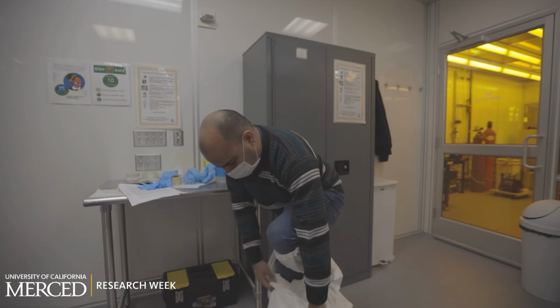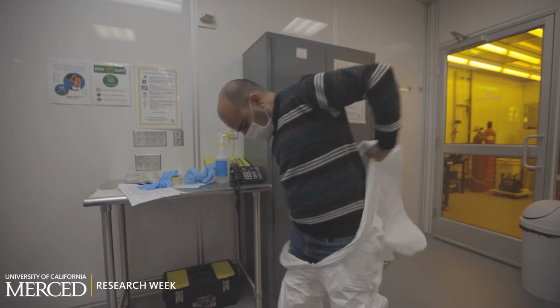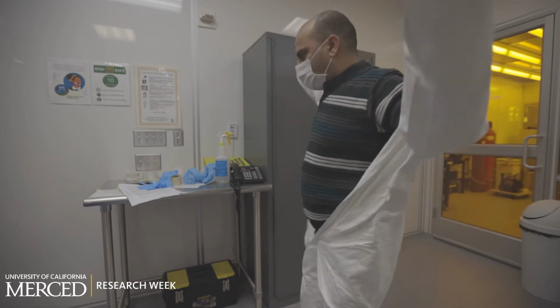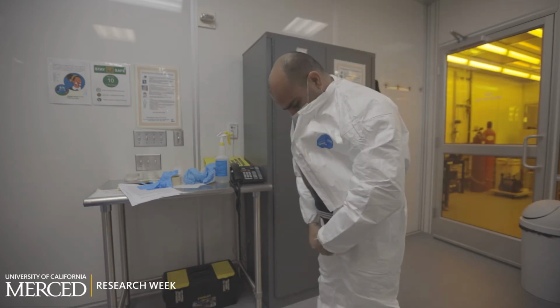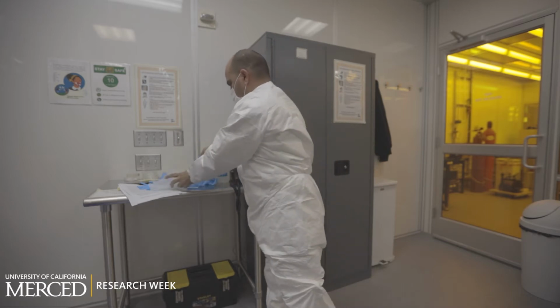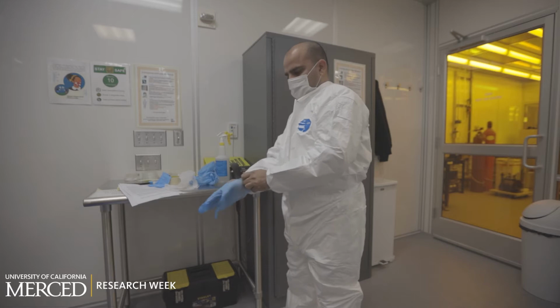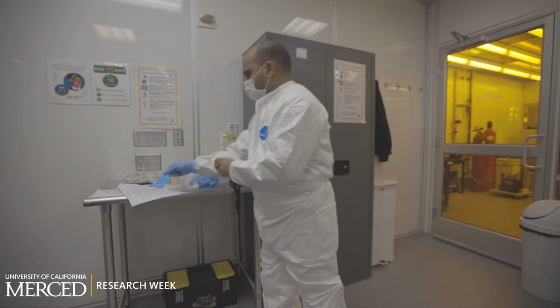The fewer particles that are allowed at any given time, the more precautions there are to prevent contamination. Any item which may add contamination or dust is restricted from entering the cleanroom. This includes lead pencils, regular notebooks, papers, cardboard, and more. All users are required to put on full-body gowns prior to entering the cleanroom.